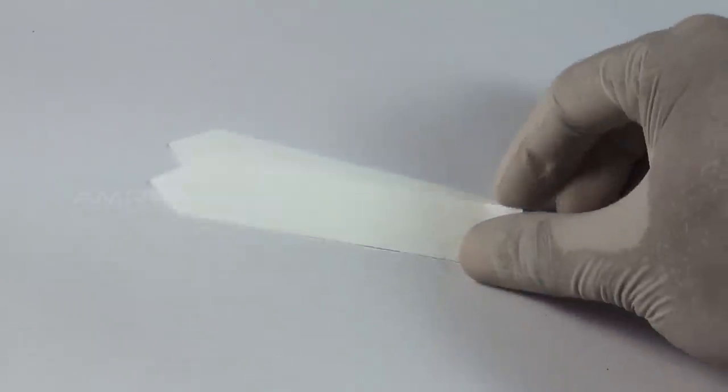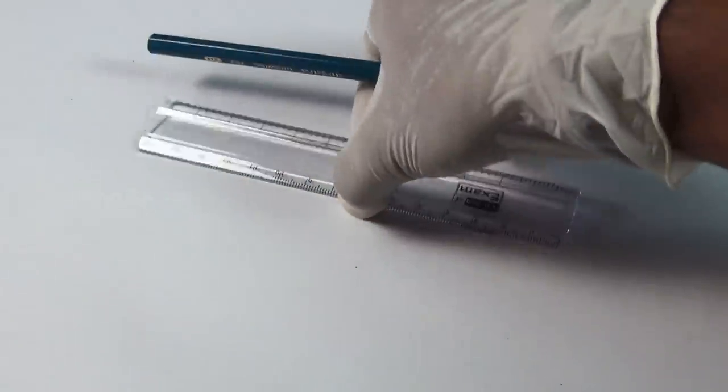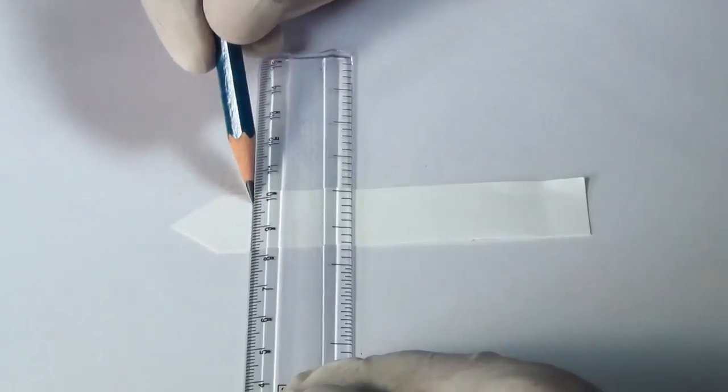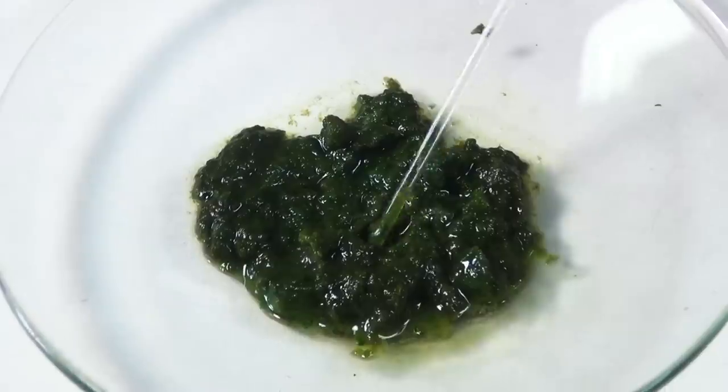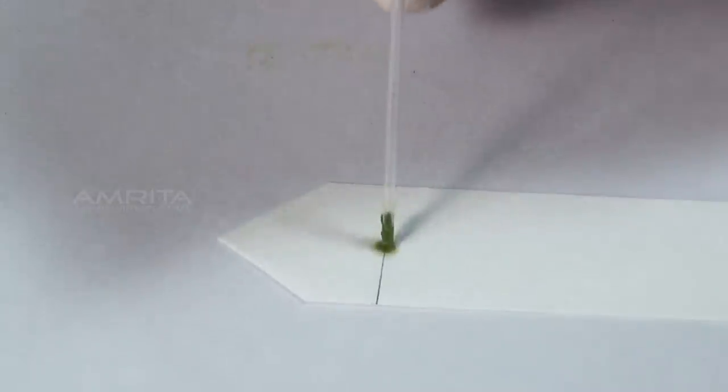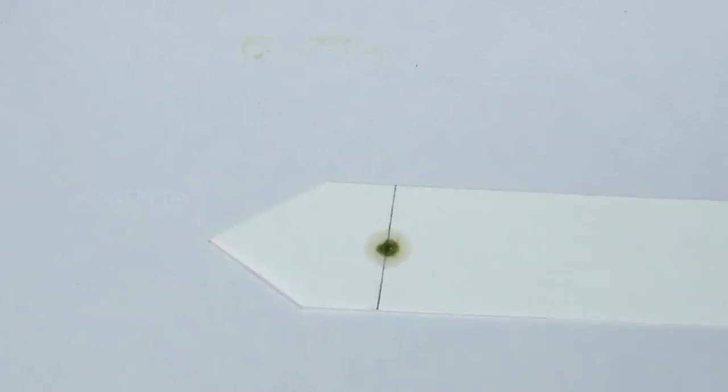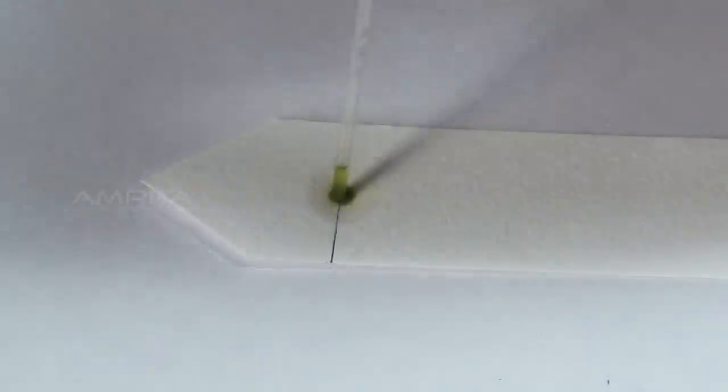Take a strip of filter paper having a narrow notch at one end. Draw a horizontal line with the pencil about 2-3 cm away from the tip of the notch. Put a drop of the pigment extract in the middle of the line with the help of a capillary tube. Allow the drop to dry and repeat till 4 or 5 drops are placed on the paper.